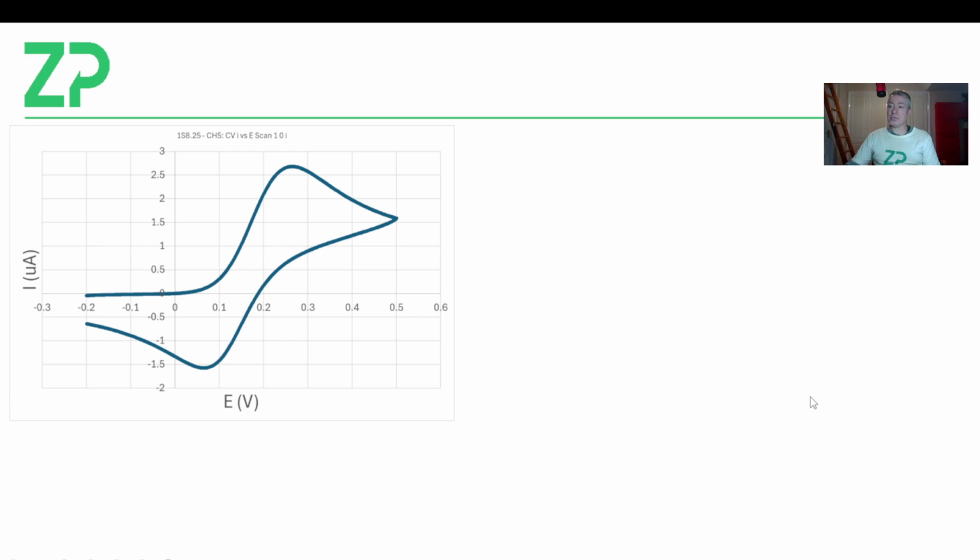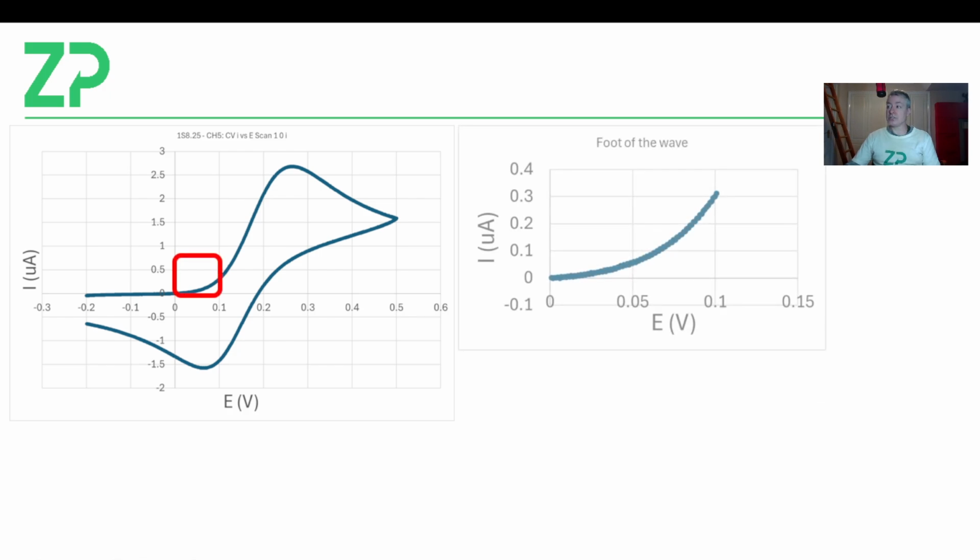Now, the first thing that we do is, I have a cyclovoltammogram here, and I know which region I'm interested in. So I just grab the data from that particular region. You can tell by the formatting that I've done this in Excel. I am thinking about doing this in Julie, which is an online database that we have, or Julie plus some Python scripting, because it's a bit manual the way I did it. Like I say, it's not something we do a lot of, but I've done it in a very manual way.